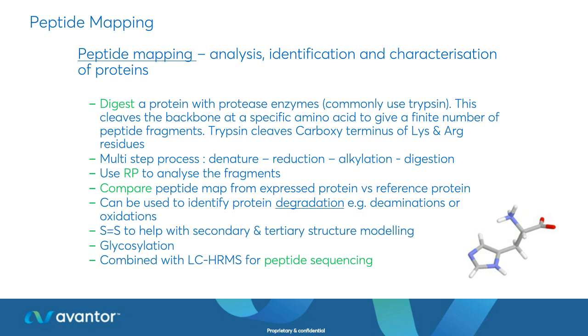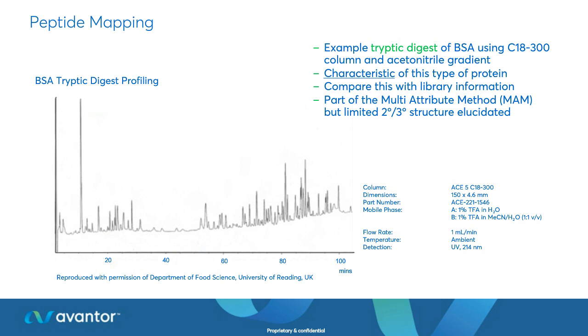When you've got such a complex mixture, reverse phase isn't always enough. So the 2D analysis using maybe ion exchange, or more commonly now HILIC, is favoured because then you can actually get a bigger separation of some of those more hydrophilic or potentially charged peptides. So you can couple these together to get more information. And here's just an example of what these look like, these peptide maps.